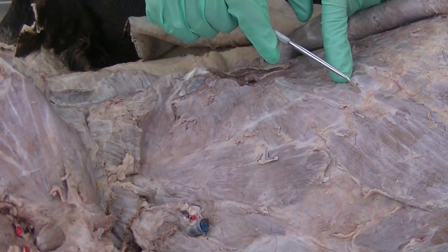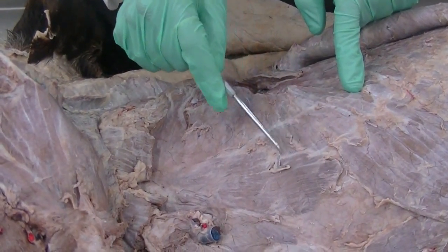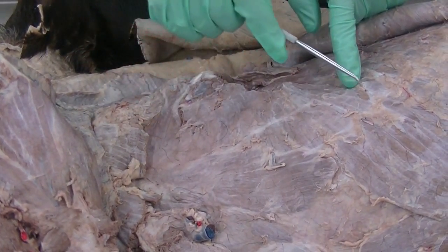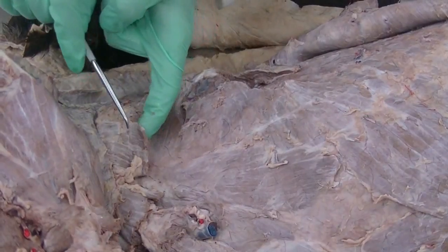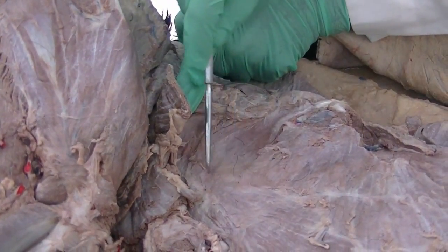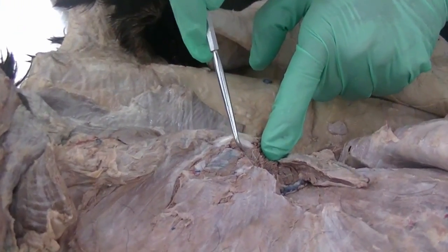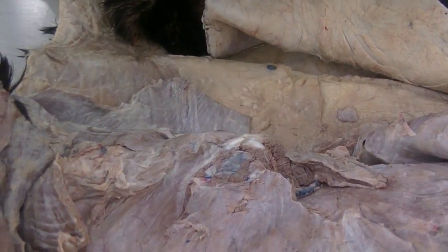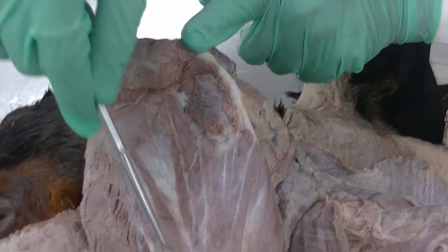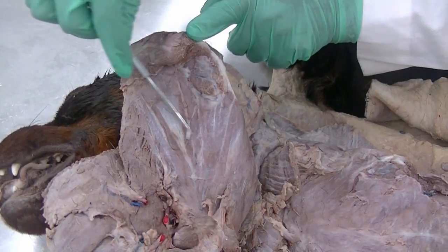From around rib number 8 all the way to the cervical vertebrae, that muscle with serrated margin is a fan-shaped muscle which extends from the thoracic region to the cervical region. As we reflect some of these muscles, we can see the remaining part of the serratus ventralis associated with the neck, and we can see the area where it is attached to the scapula on its medial side. This is the attachment area for the serratus ventralis on the scapula, while the rest of the subscapular fossa is occupied by the subscapularis muscle.